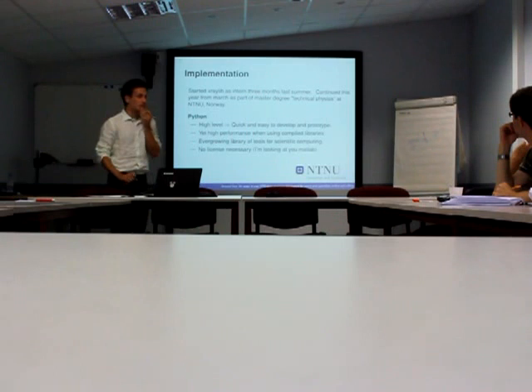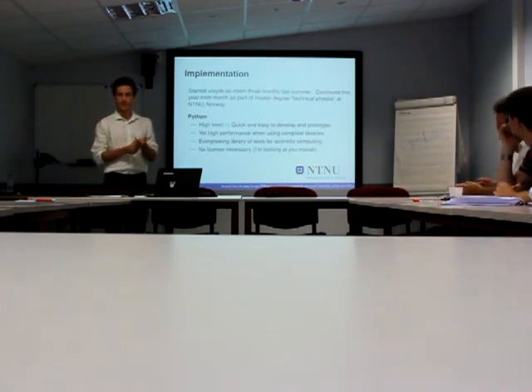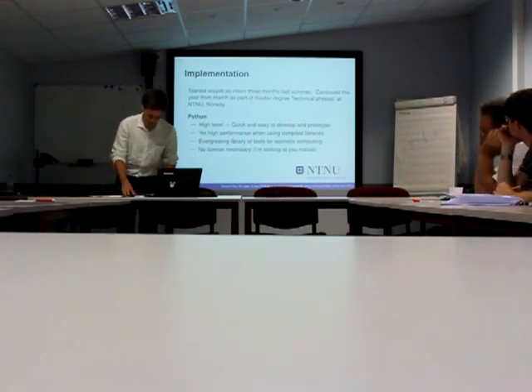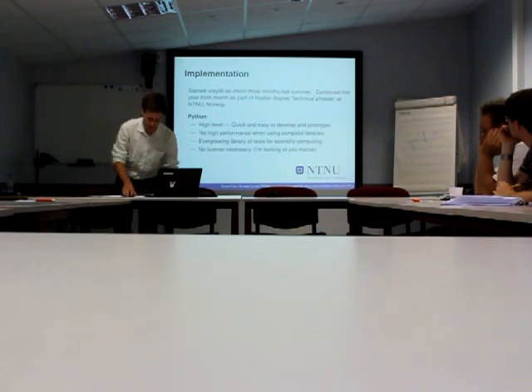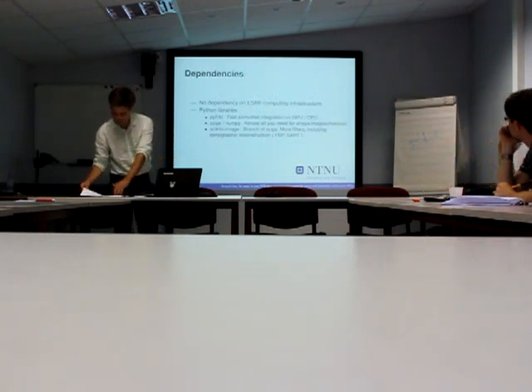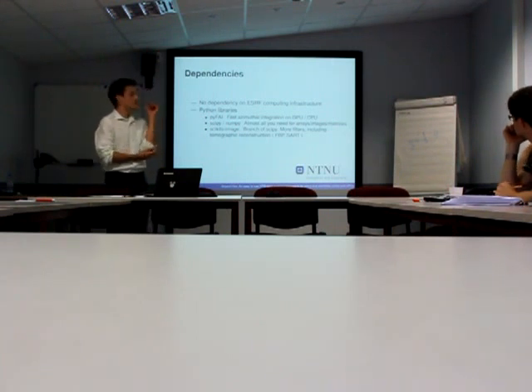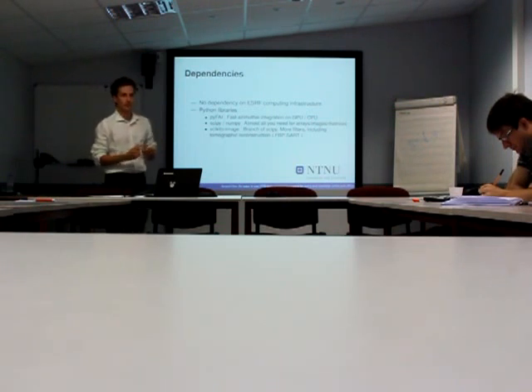So it's written in Python, which was chosen because it's pretty high level, so you can develop code and prototype quickly, yet still have very efficient code if you use the right libraries. And you don't need any license or stuff like this to use it. So for external users, it's very important that you don't have a dependency on ESRF computing infrastructure.